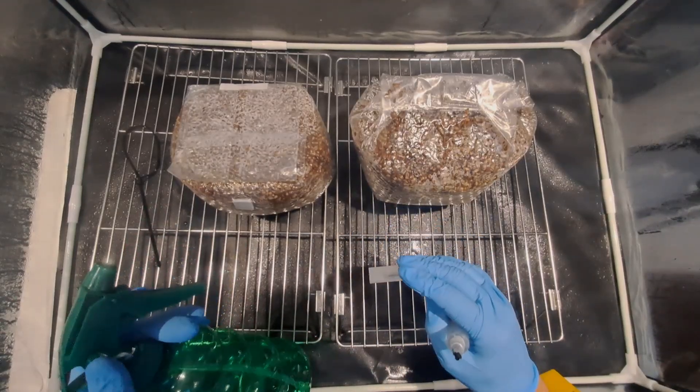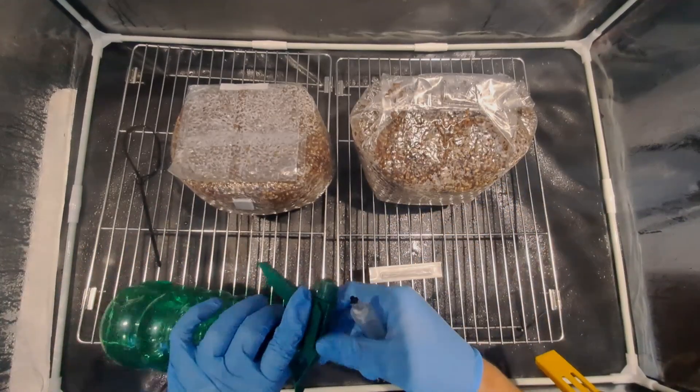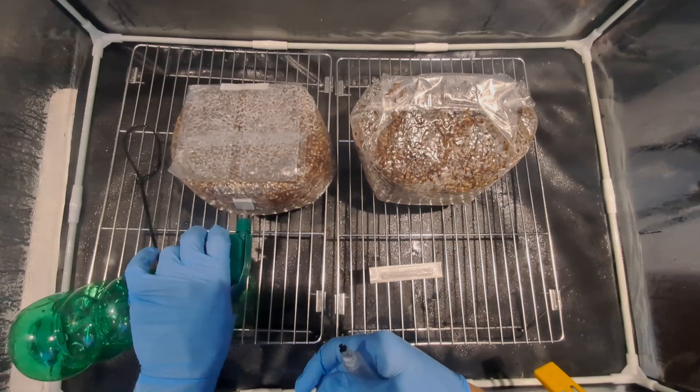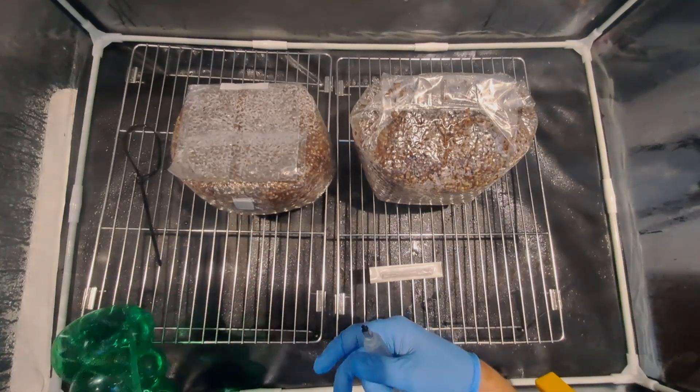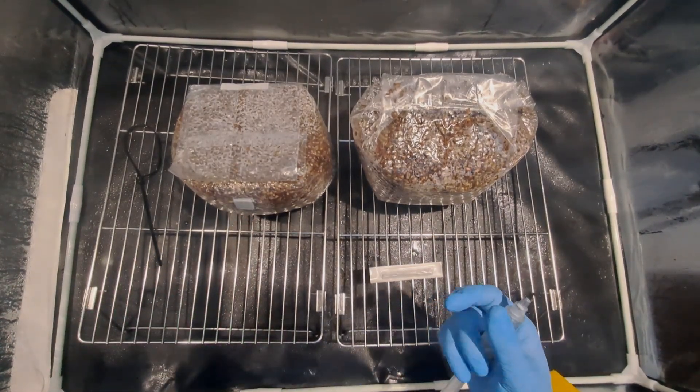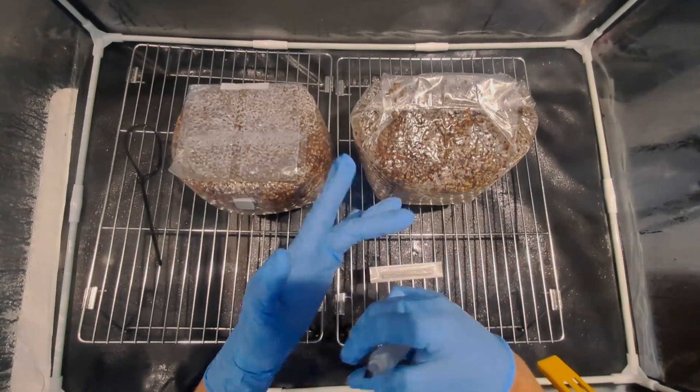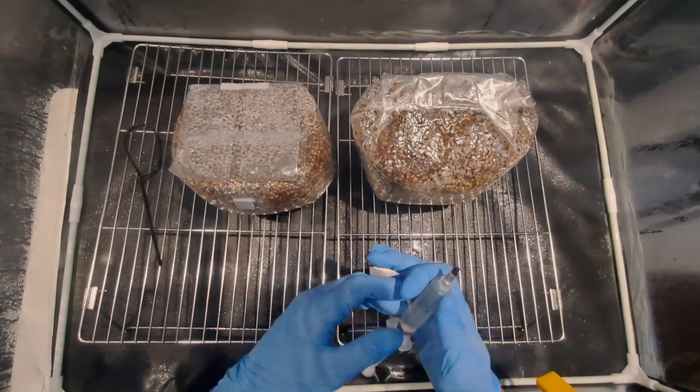I then spray the injection port with alcohol. Normally I wouldn't use a spray disperser inside of a still air box it's better to use wipes because you're essentially just creating turbulence every time you spray inside of a still air box.